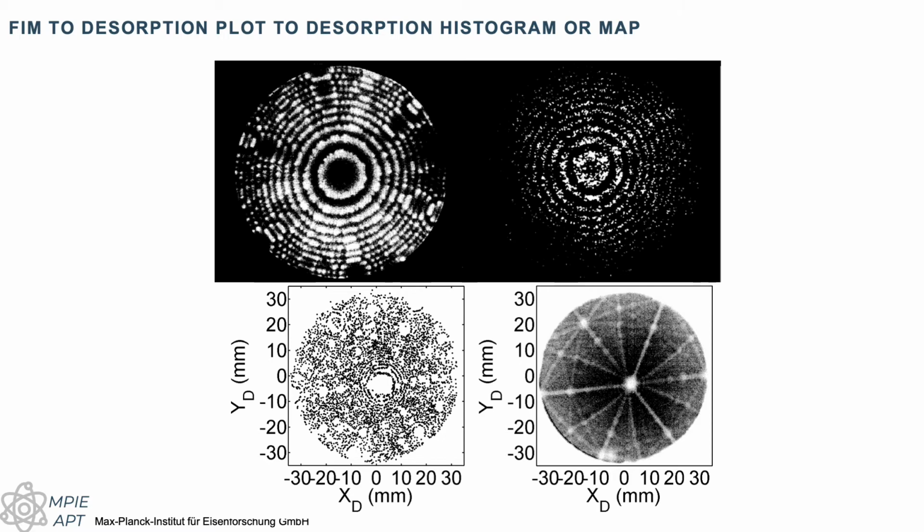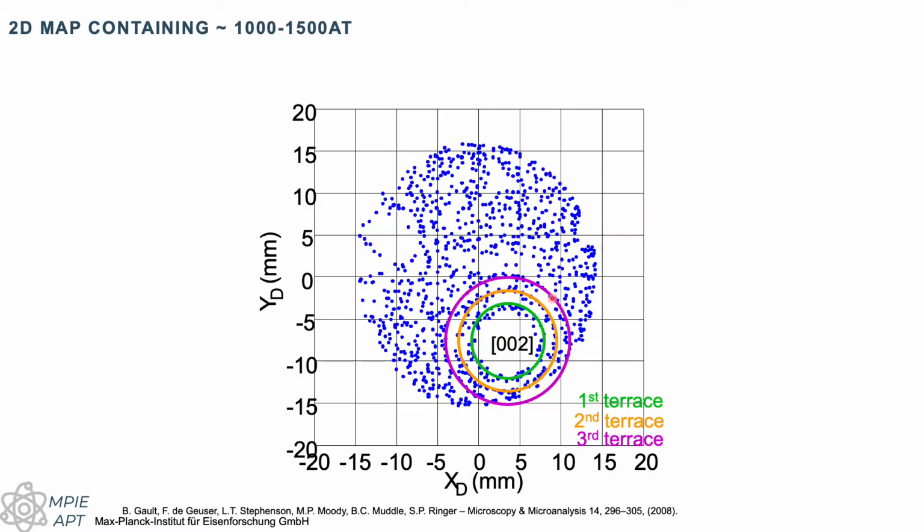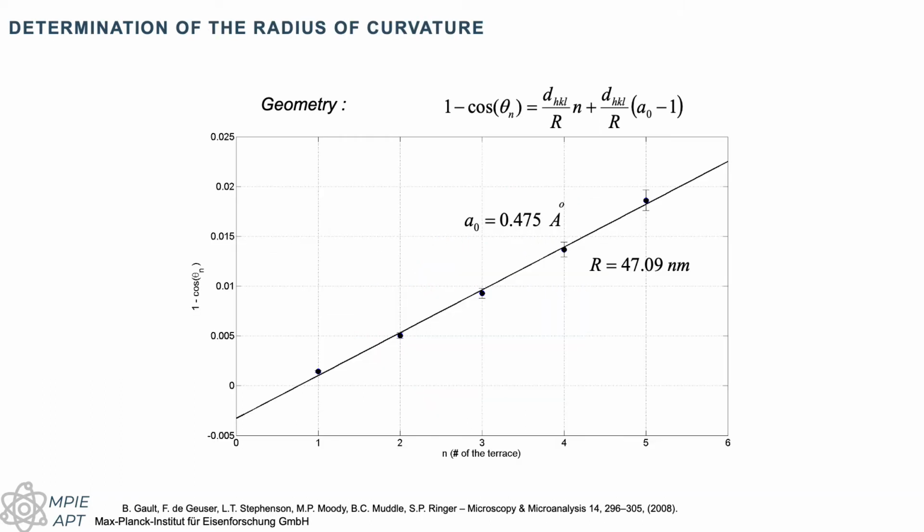And so we can actually see the rings and measure the ring radius directly from the detector coordinates, do the same types of fit, and get an idea of the radius of curvature. And in that case, we can actually know almost everything about the specimen, the radius, the K, the image compression, all just by looking at the detector coordinates.